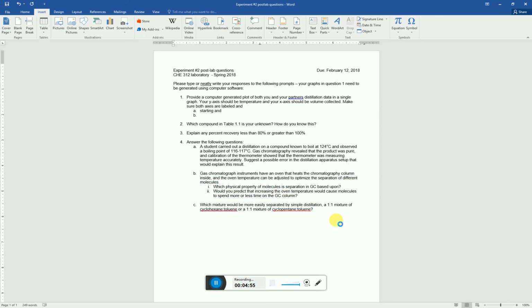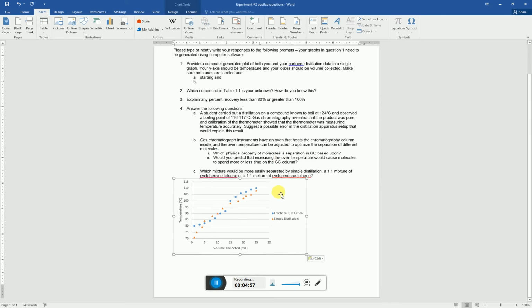We could just copy and paste that in here, and that would work. We'd want to add some kind of a figure legend on here so that everybody knows what this is a graph of. Or alternatively, you can put a title on top of the graph. You need to have one or the other.